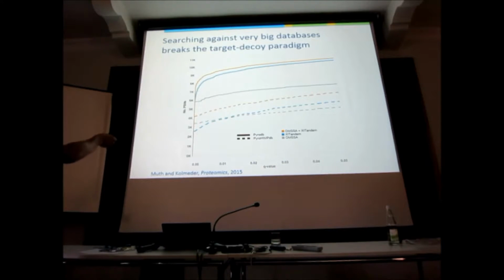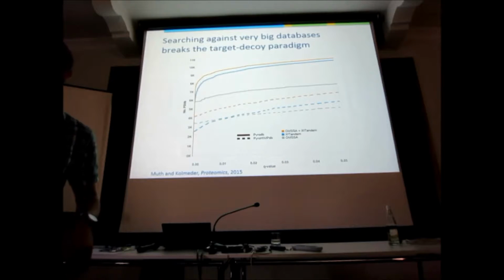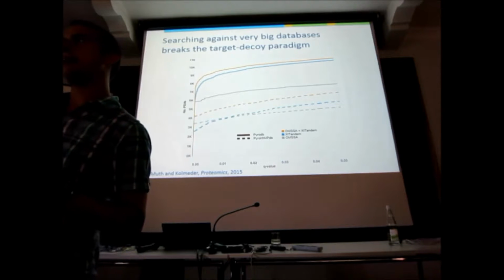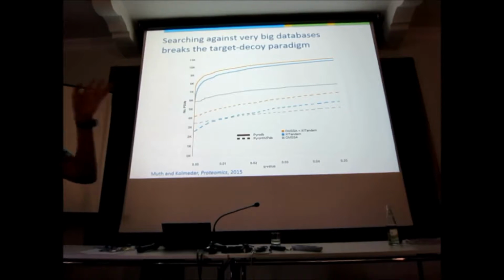Now, as we've seen before, Tandem outperforms OMSSA. No surprises, everybody knows this. Now, this is the normal Pyrococcus database, and what we're doing now is the inverse of what we did before. We're taking Pyrococcus data and searching it against the Pyrococcus database, so we're identifying Pyrococcus proteins. This data comes from a QExactive, so it's high MS resolution. This is the best data we can have right now. We identify a lot of Pyrococcus proteins, everybody's happy, X!Tandem does better than OMSSA.